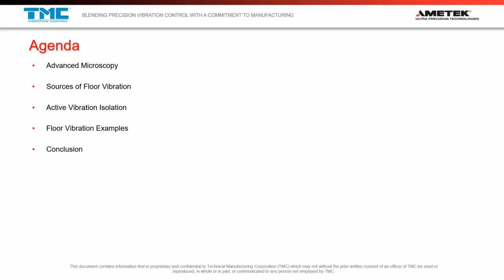I think if there's questions, or if you guys would like to do a more in-depth dive into this type of technology, you can always contact us at TMC separately, and we have lots of other content and webinars that we've done on this topic. It's a pretty robust and complex topic, using piezos in floor vibration cancellation.